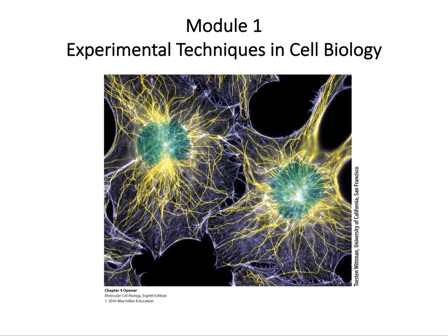In Module 1.1, we are going to learn about the experimental techniques in cell biology. I have confined the topics to mainly cover some of the routine methods used by scientists to study the cells. The topics will include growing cells in the laboratory outside a living animal, visualization of the cell and its structural components, and isolation of subcellular components.